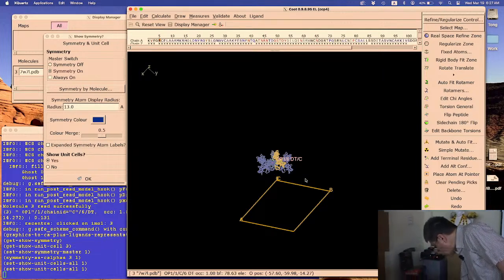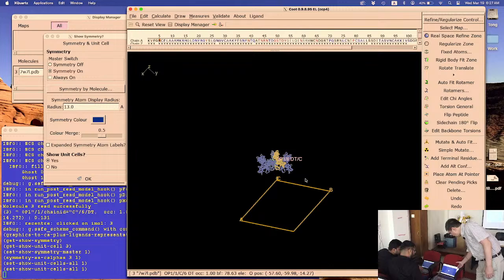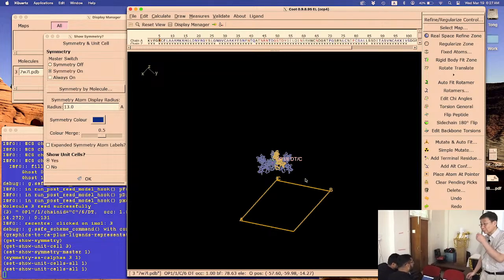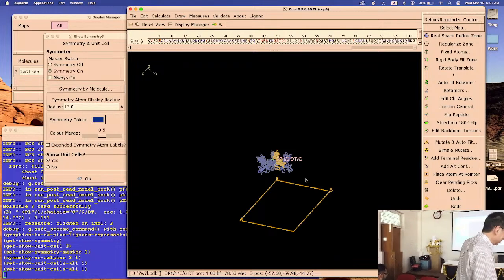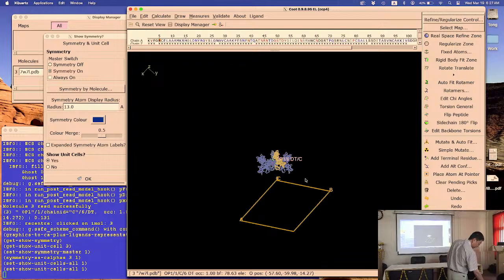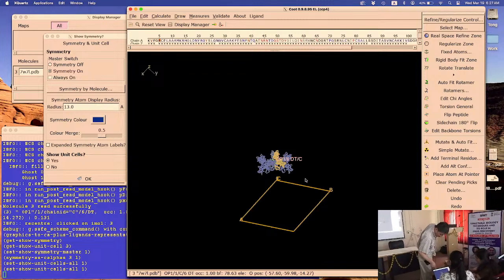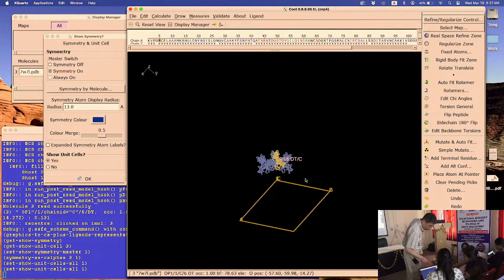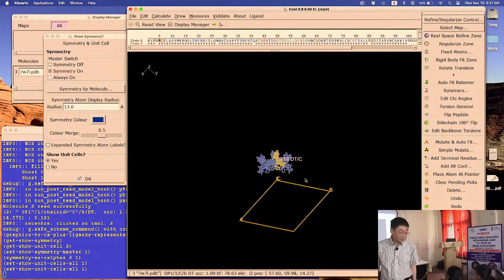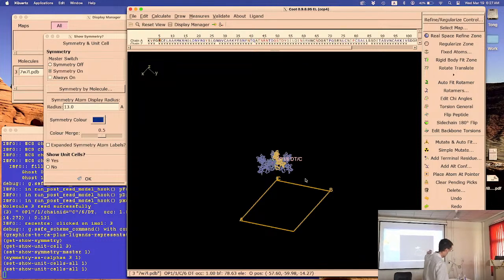Yeah. Turn. Now you're 90 degrees away. Turn up. There you go. Getting close now. Close. Okay. Where's your display? Display bar here. Yeah, zoom out more. Good, good. Make it as close as possible, okay?